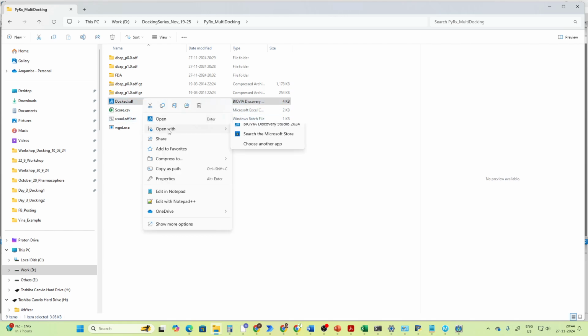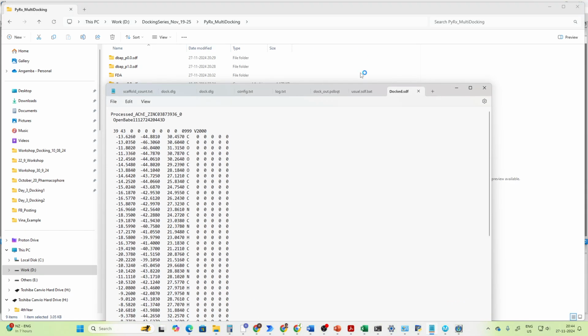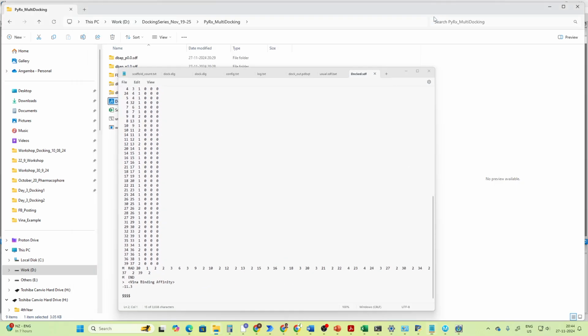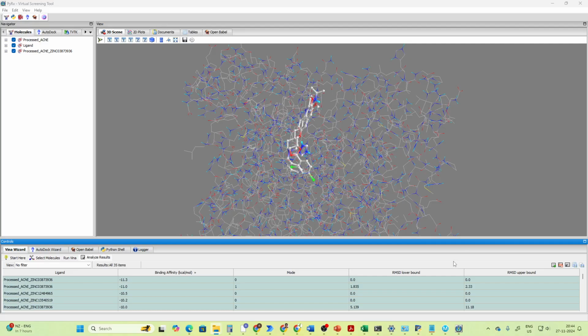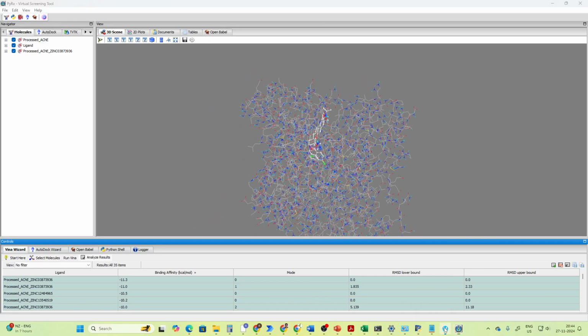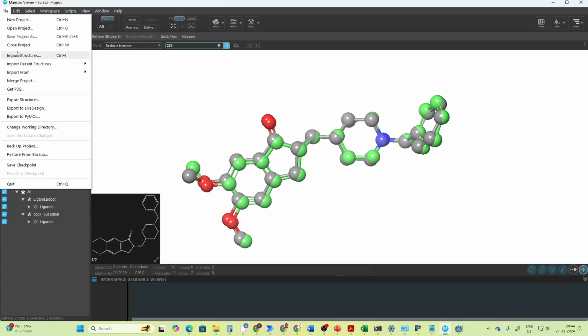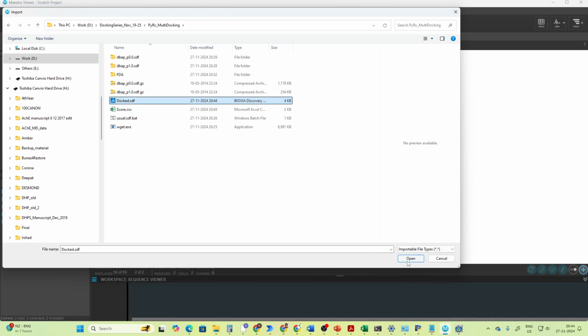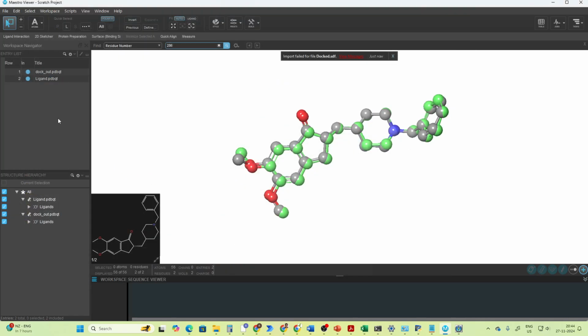So it's only downloading a single molecule at a time. This one, right? Only one molecule at a time. All right, so we can just import this. Okay, it's not able to import the SDF file. No issue.